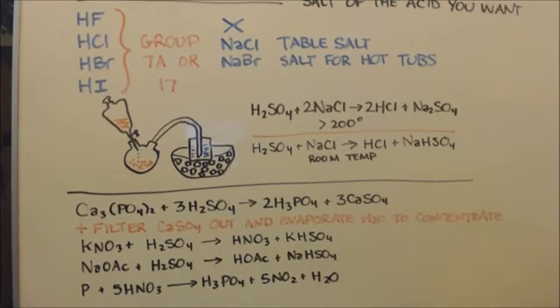You put it in a distillation apparatus and distill a lot of the water off, and just like with sulfuric acid, it'll keep concentrating the phosphoric acid if you distill off the water. And then you'll have pretty pure phosphoric acid. You can even distill it too, to make it definitely pure. I don't know what the azeotrope goes up to.